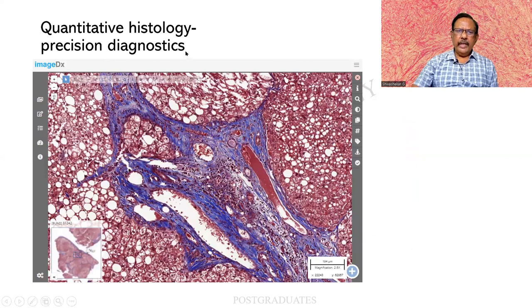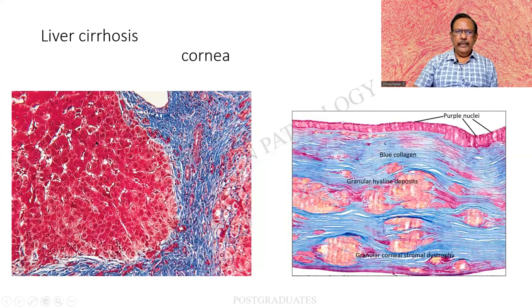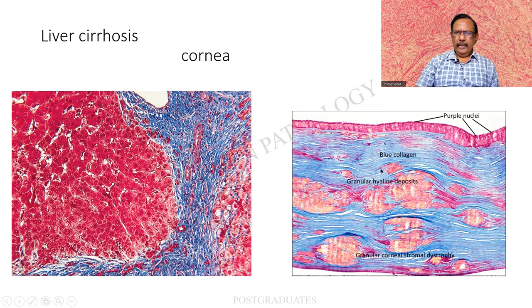This is a picture of liver cirrhosis — I am finding a fatty change, effacement of architecture, and an in-growth of connective tissue producing pseudolobulation. Seeing Masson's Trichrome in action: the parenchyma takes up a red color but I am more interested in the connective tissue, particularly in the early stage of cirrhosis where this stain is most useful. This next image is a cornea, with the stroma taking up a blue color, some granular hyaline deposit, and a purple-color nucleus stained by Weigert's haematoxylin.